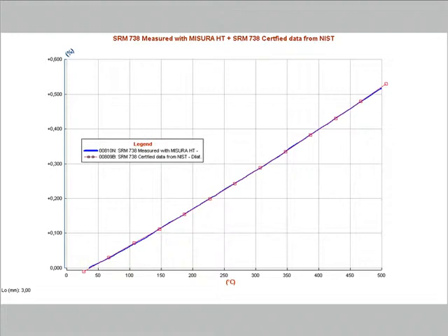This graph is showing the result of the measurement of the standard reference material 738, the blue line, supplied by the National Institute for Standards and Technology, NIST.